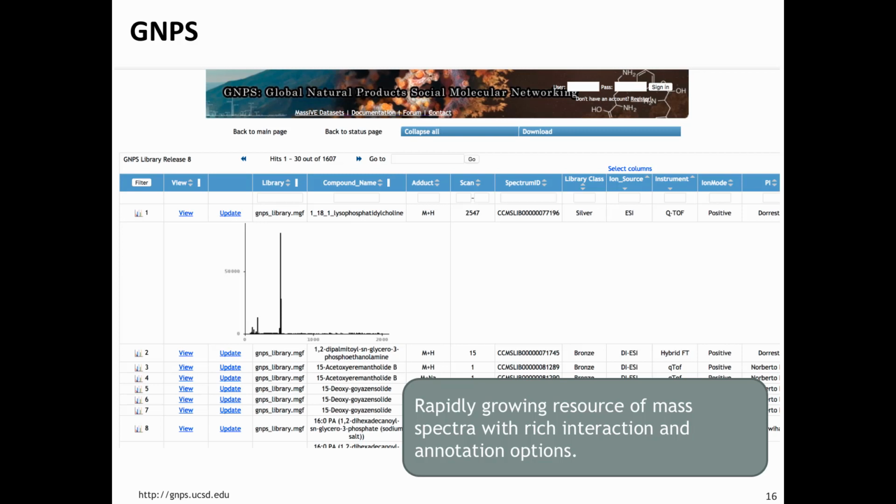And they will try to match these spectra and identify who else has seen the spectrum. And the idea is there's a community effort. You know, if someone identifies their spectrum and says, after 2 years I figured out this is X, then you can add the annotation, and then all the other guys who have seen this spectrum or a similar spectrum will know this looks like it's X. And that is a very valuable effort. It's also very well done. And I can only encourage you to go to GNPS and try to upload your spectra there to search for it.